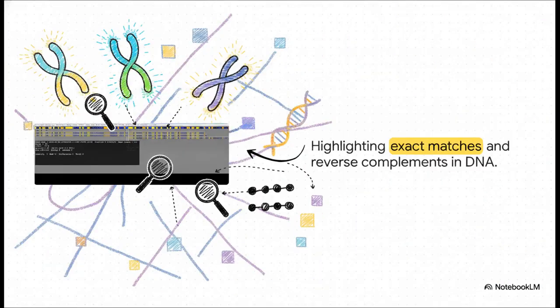Notice how biological markers, like the telomeres at the ends of chromosomes, literally light up on the display. The browser lets you hunt using exact matches, reverse complements, or even wildcard searches. By replacing bases with a dot, you can allow for specific mismatches. This lets researchers find hidden evolutionary landmarks even if the DNA has slightly mutated over time.